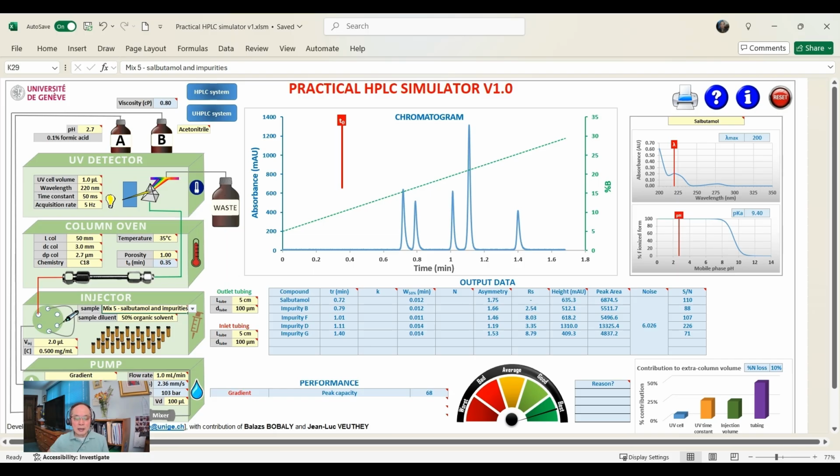one can see that things are much better. The resolution is much more improved because now we're pushing out the analytes in a much slower fashion. Instead of going to 95%, go 0 to 40. So one can play around with the gradient segments and get all kinds of effects, in terms of training your mind on how things respond to the various parameters.